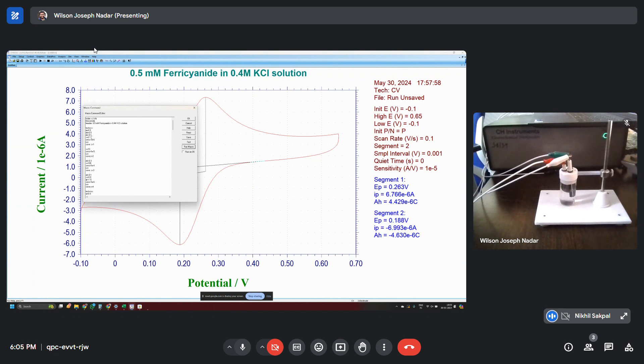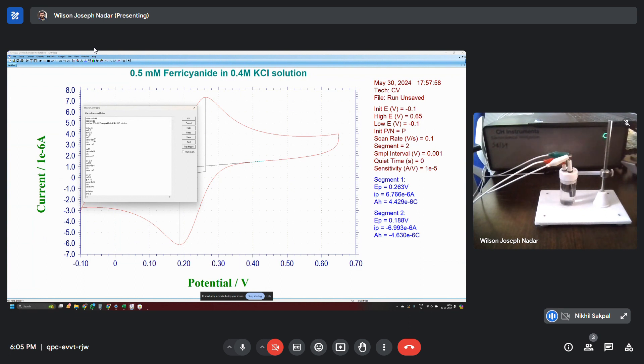And then sensitivity. SENS equals to 1 E to the power minus 6. E minus 6. If you write this, this will be in the sensitivity scale of 1 micro ampere. That can have a maximum current measurable capability of 10 micro ampere.